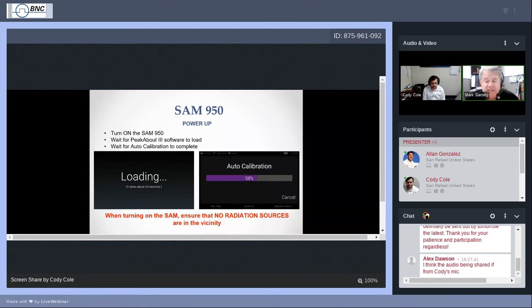1,461 keV is for the potassium-40, or the K-40. So that peak that I see must be the potassium peak, and I'm going to adjust my graph so that the point of 1,461 keV is on that peak. We don't want other isotopes in the area to accidentally provide some larger peak and cause the potassium peak to disappear into the background. We don't want the SAM to look at a very large peak and say, "Oh, that must be the potassium peak," and put that 1,461 keV position on the wrong peak.